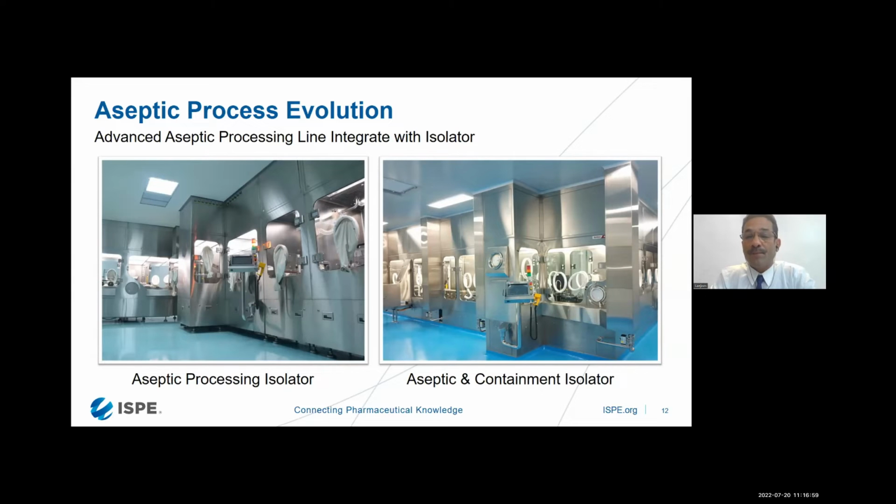Some compounds which are in powder form and very potent are categorized as OEB level 4 or OEB level 5, and in powder form are normally handled in negative pressure isolators. But the most common isolator used in pharmaceutical applications is the positive pressure isolator.